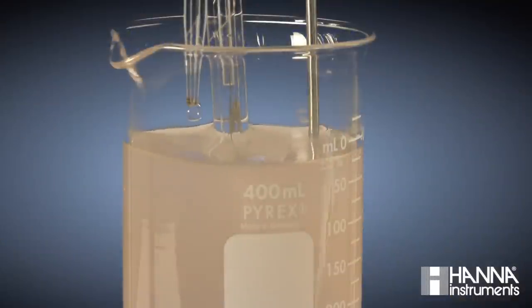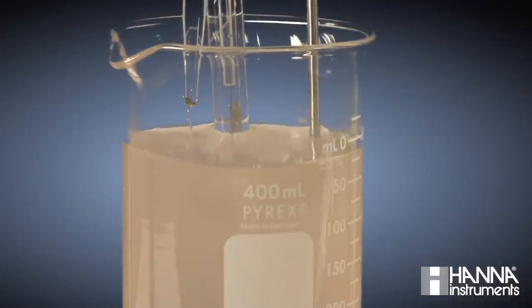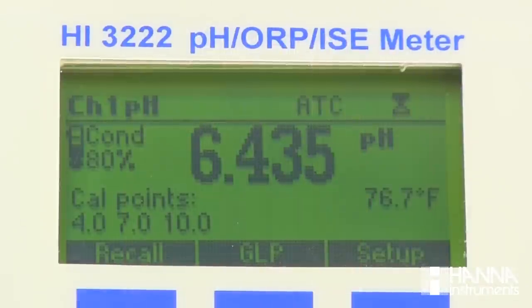As we get closer to the endpoint, we're seeing that the colors begin to flash in the solution, but the color change is not sustained, indicating that we aren't yet at the endpoint.